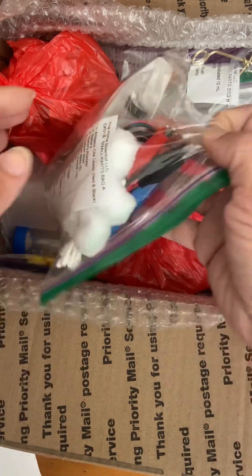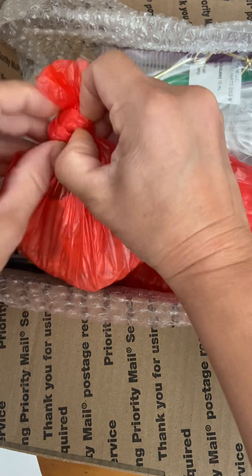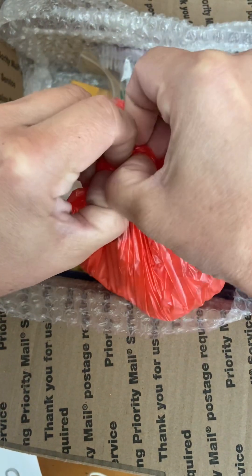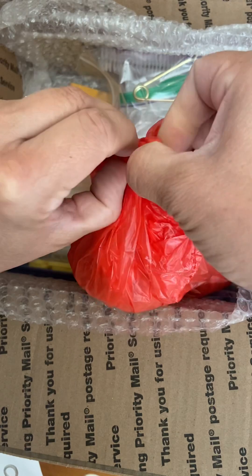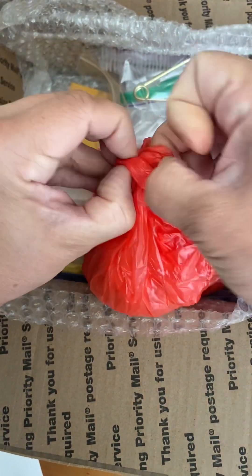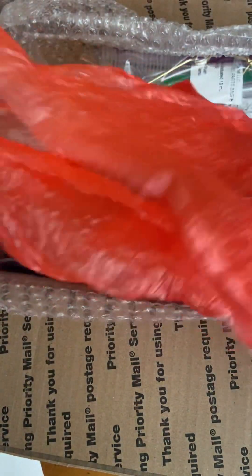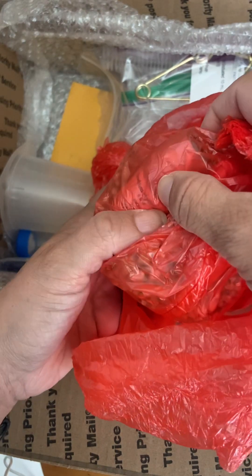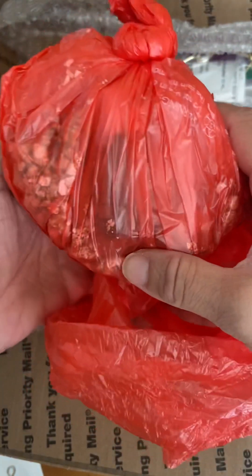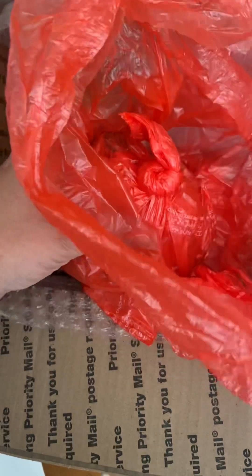We've got safety goggles, and then there are these items in here. I'm trying to get this open without cutting it, because then it will be more difficult to contain. In here it looks like there's a bunch of chemicals — sodium hydroxide and other things packed in what looks like an absorbent material. I'm going to go ahead and leave that in there and retie it in a second.